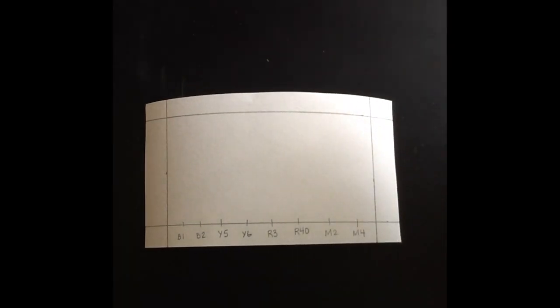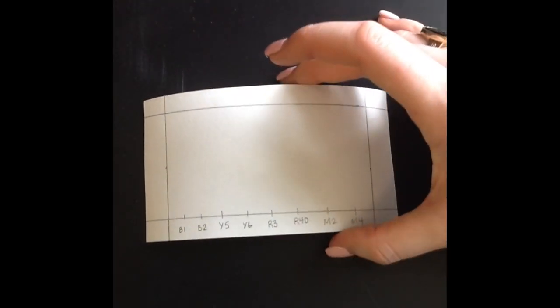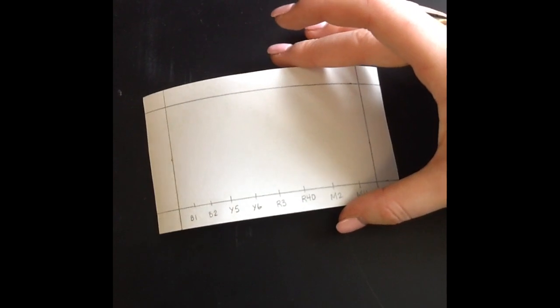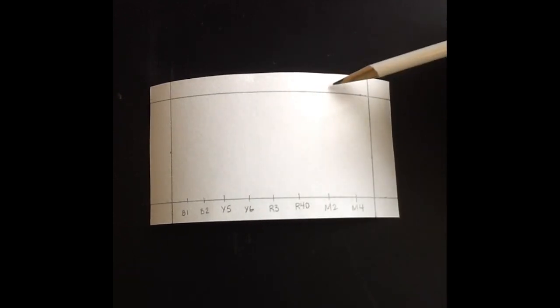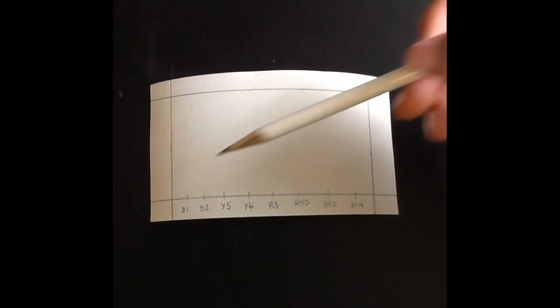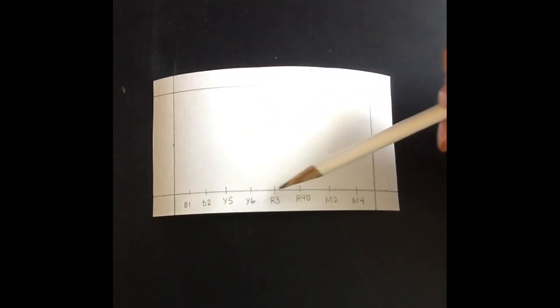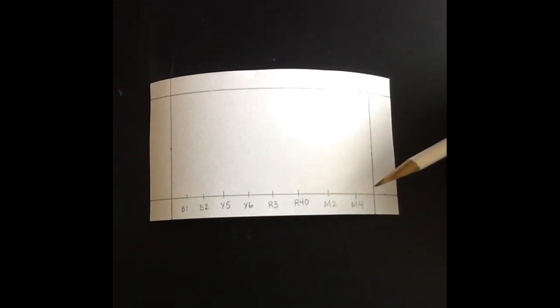To begin, lay your chromatography paper so that it is curved downward. Using a pencil, draw a line 1 cm from the bottom. This will be called the origin. Draw a line 1.5 cm from the top and sides. The top line will be called the top margin. Label the origin line with the dyes provided.